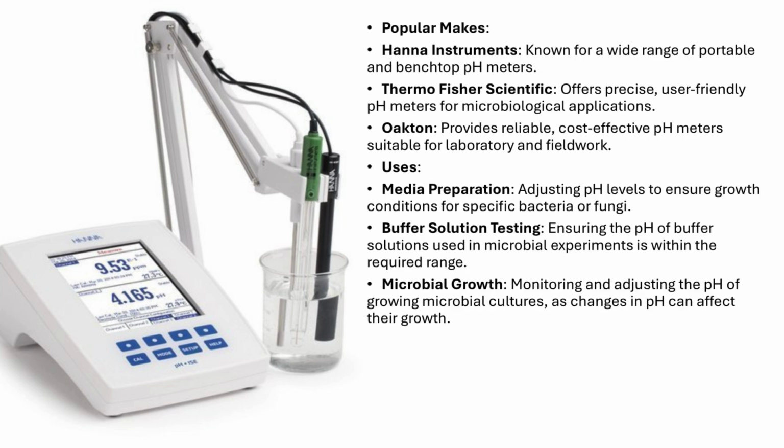Popular makes. When it comes to reliable pH meters, brands like Hanna Instruments, Thermo Fisher Scientific, and Oakton are well known for their high-quality, user-friendly devices, designed for both lab and field use.